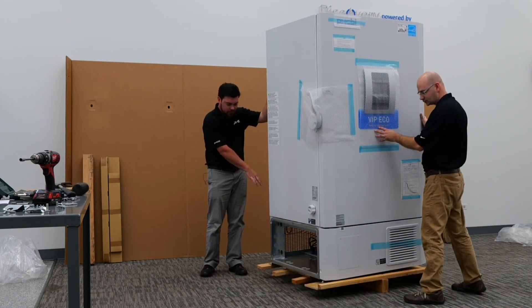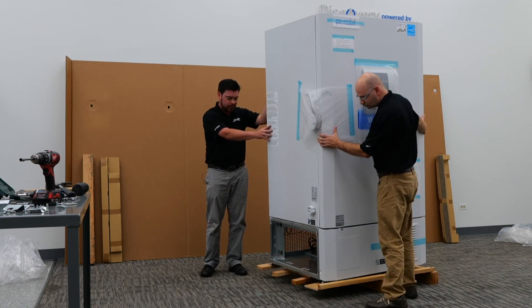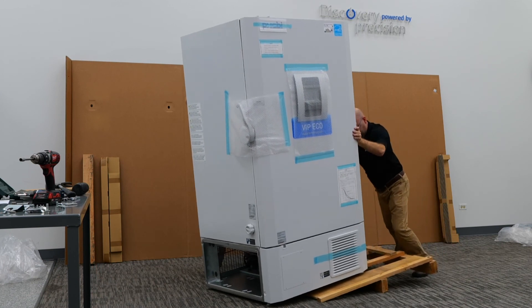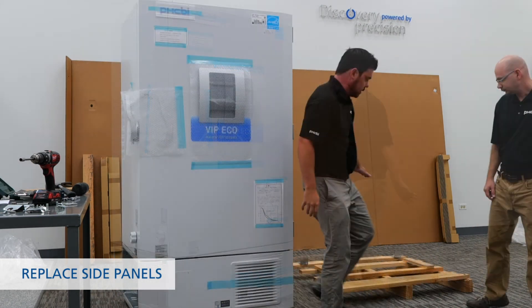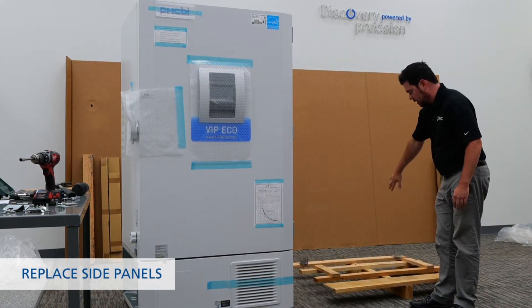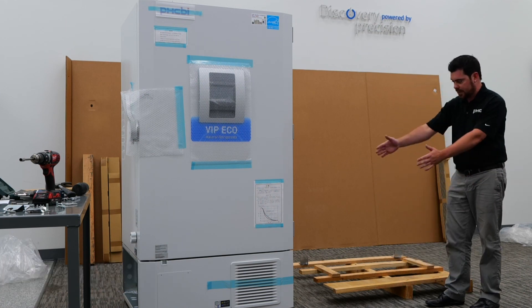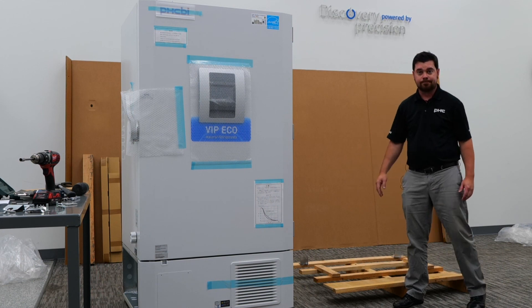Now that we've created a fulcrum, this is going to allow us to ramp the unit down off the skid. We used the fulcrum created by removing the side piece from the skid, and we're able to slide using momentum the minus-80 off the skid.